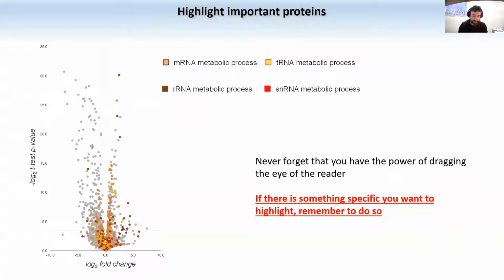Now it comes, after you displayed your data in a way that is helping you to decipher, am I data, is there any change between my samples? Now you can start to include into your data representation biological properties, right? And the good thing about proteomics is that you don't really start from zero. There are databases that are rich in annotations for the proteins that are in your list. For some organisms, of course, the annotations are much worse than for others. But for example, if you're working with human proteins, they have a lot of information.